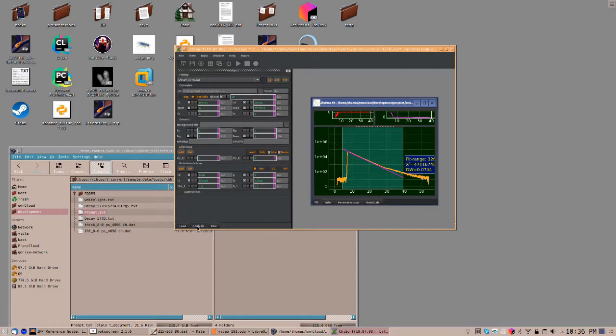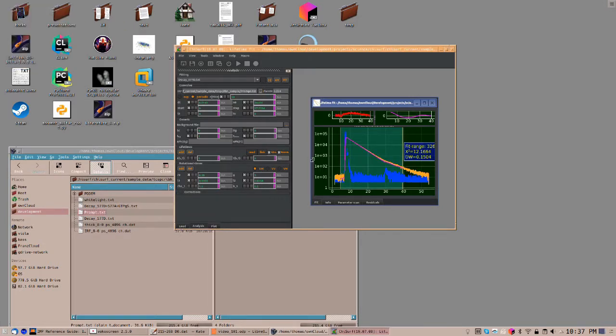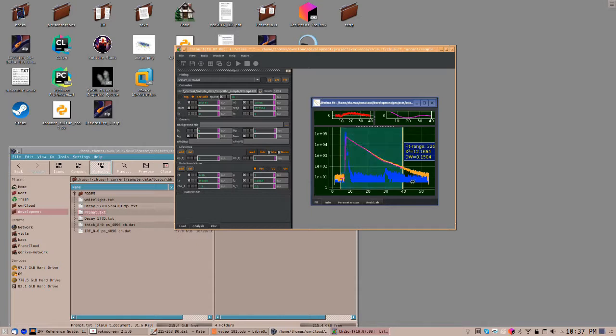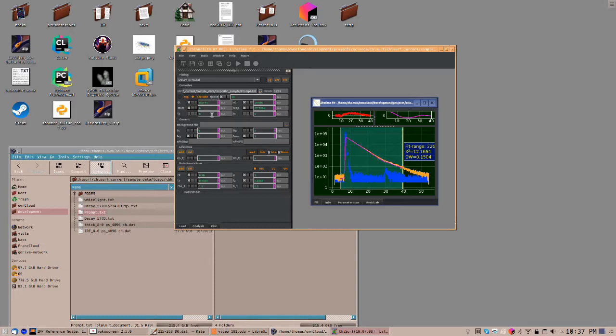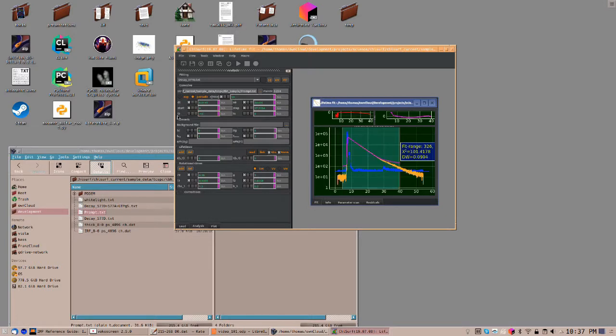Now, go here to the analysis. Here, you should select the instrument response function. Now, you can see here in blue the instrument response function and the model convolved with the instrument response function. The lamp background is referred to as LB. A positive value subtracts a certain number of counts from each channel. A negative value adds counts to every channel.